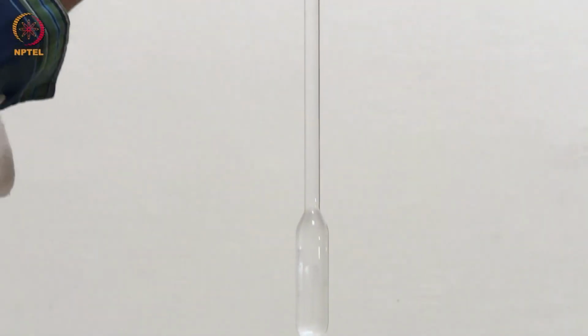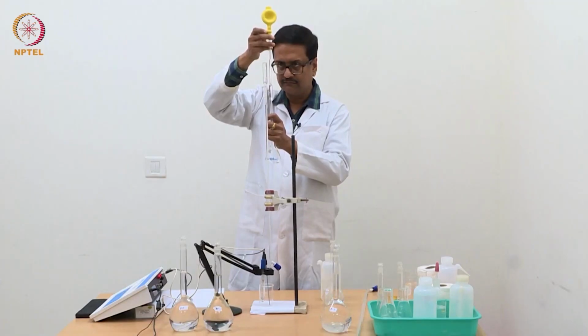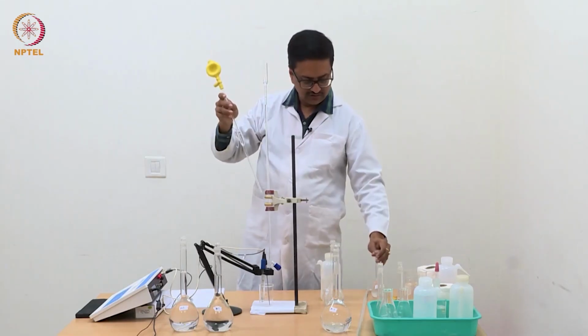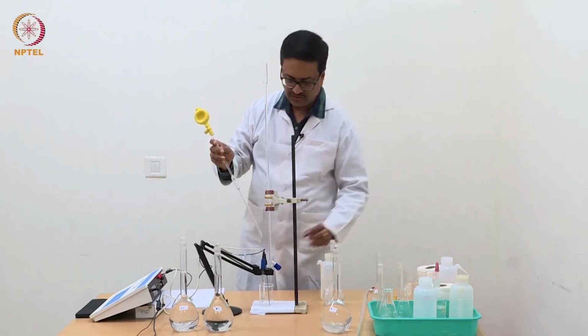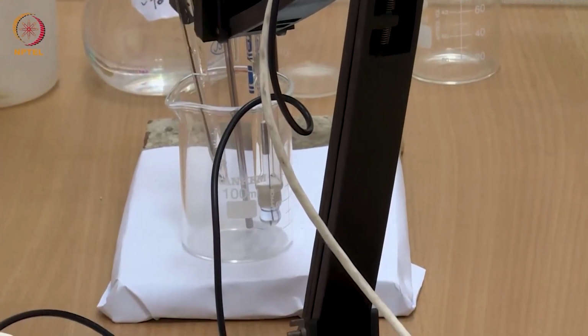We should carefully reduce the height to the mark. And then transfer this acetic acid solution to this beaker in which we will be doing the titration.